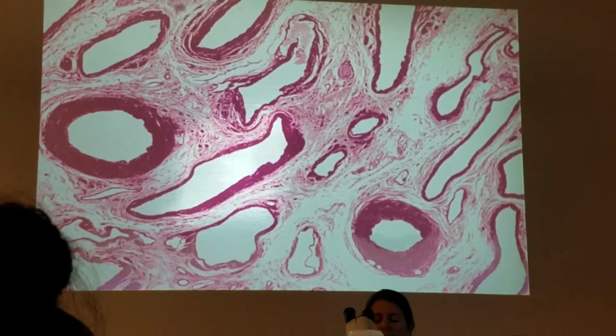Okay. So artery vein slide, three things you have to know on each. You should be able to recognize an artery and a vein. On that first slide that I showed, I had to keep going back and forth between the artery on one side and the vein on the other. For the next one there are only three: mucus acini, serous acini, and salivary ducts.